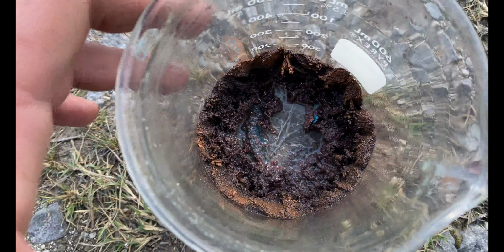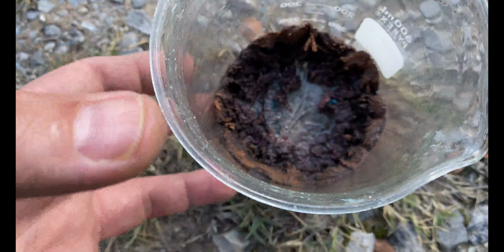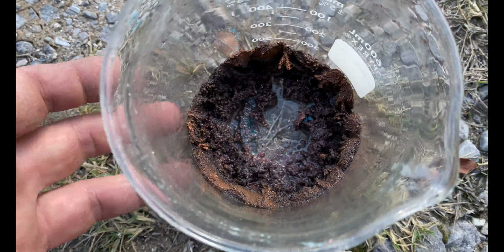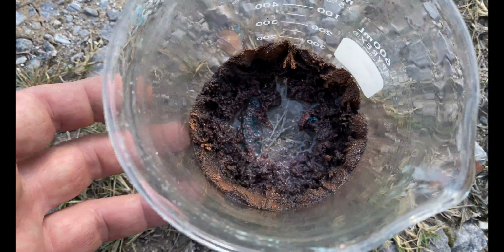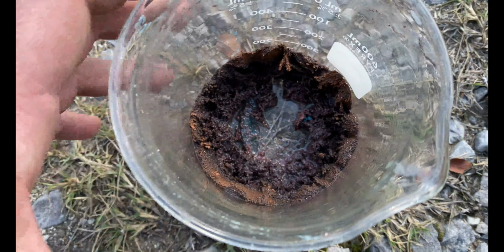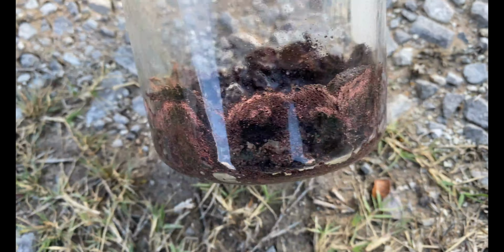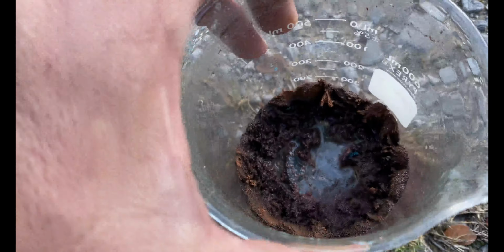And that's not what we want, because it started to weaken the mixture and change the color from a bright copper color, which you saw not long ago, to this dull color here. So apparently the repeated rinsings isn't a good way to do this. I may have to repeat the experiment, but you can still see the magnetic field patterns in there, and it did sort of hold together.